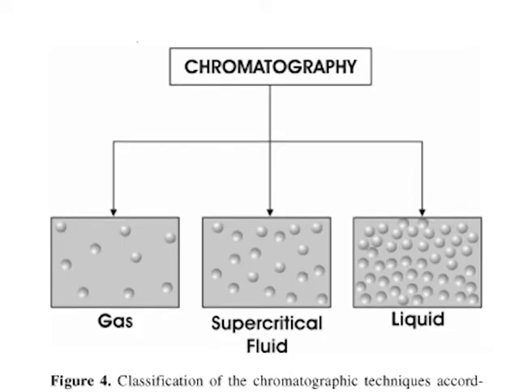Classification of column chromatography. The following table classifies the various types of chromatographic techniques based on the type of mobile phase used: liquid, gas or supercritical fluids. Supercritical fluid mobile phase method is relatively new and is gaining popularity. Liquid chromatography can be further divided into 5 categories depending upon the stationary phase used and the mechanism of redistribution followed to attain the equilibrium. Components of the mixture follow different mechanisms of interaction or redistribution, namely adsorption, partition, ion exchange or size exclusion.